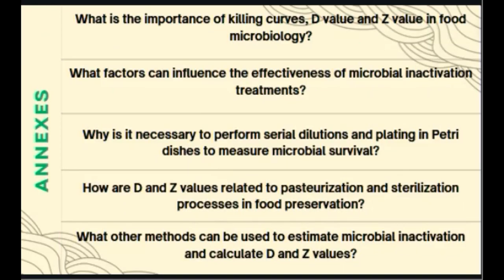Annexes. Okay, for this part, we answer the questions of the annexes. What is the importance of killing curves, the D value and z value in food microbiology? Okay, the killing curves and the D value are fundamental in food microbiology. These parameters provide crucial information on the effectiveness of heat treatment processes in eliminating pathogenic and spoilage microorganisms in foods.